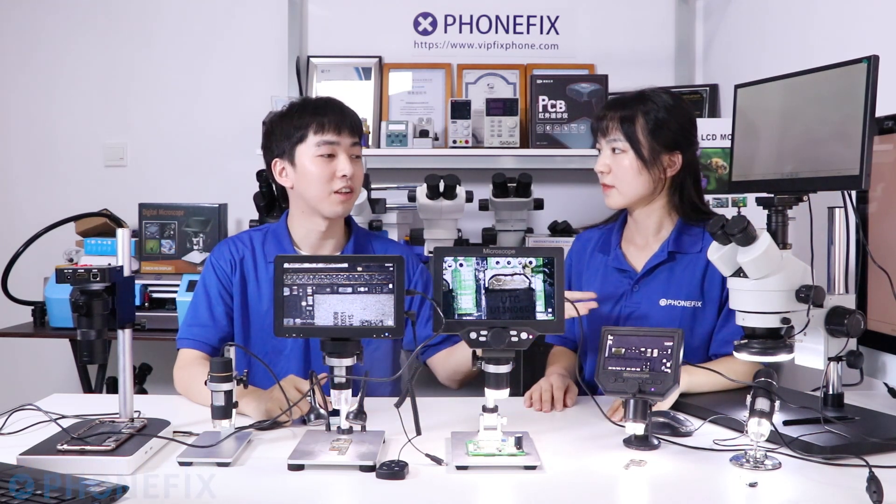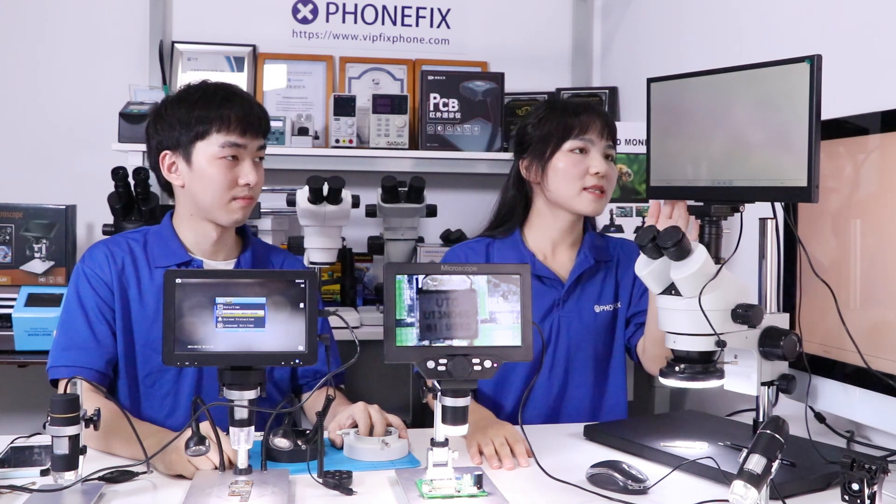The trinocular port on the microscope can be connected to the HDMI camera. Now let's start with the first microscope. The trinocular on the microscope has a 13.3 inch monitor, and besides, you can connect to the HDMI camera.